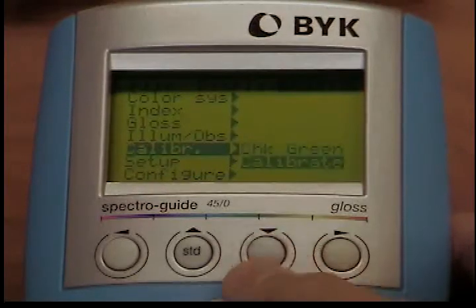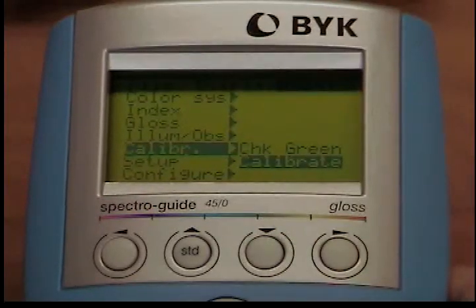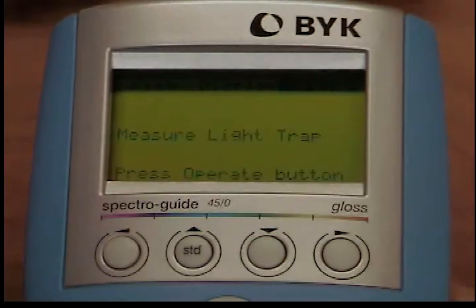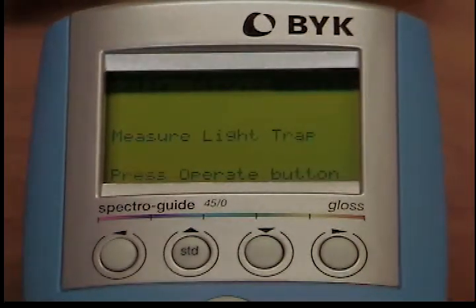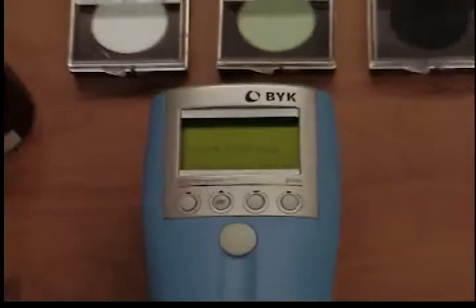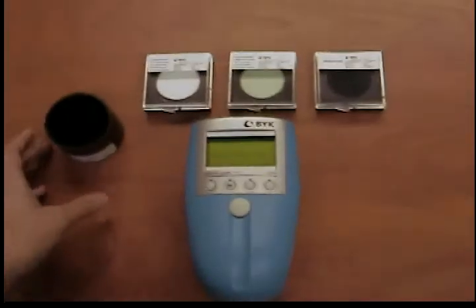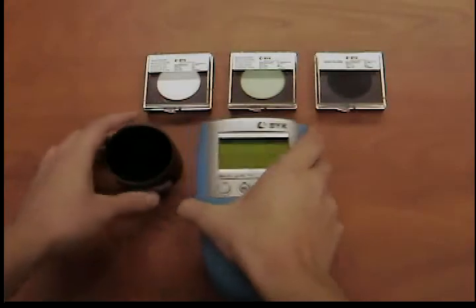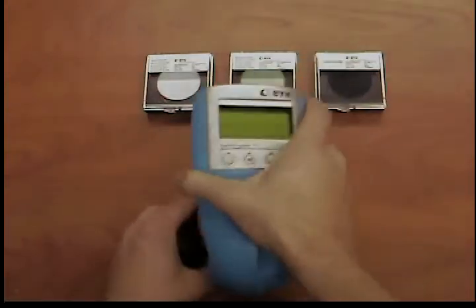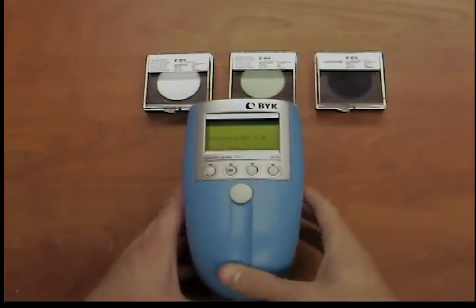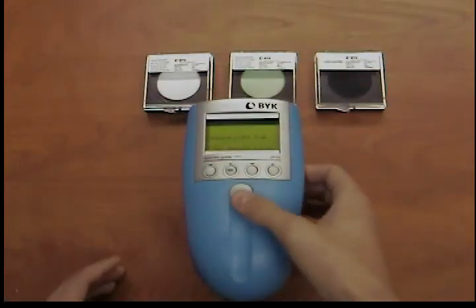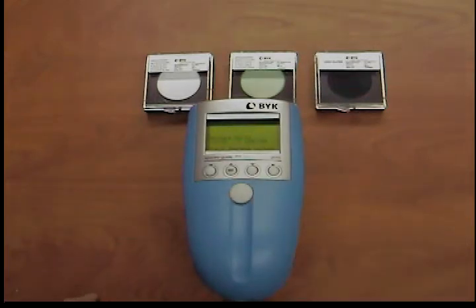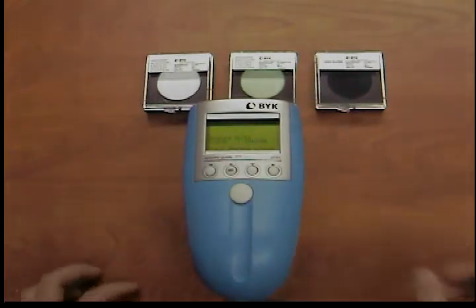The calibration will begin. The instrument will first call for the black standard. Lay the black standard under the open instrument and press the operate button. A beep will indicate that the measurement has been completed.